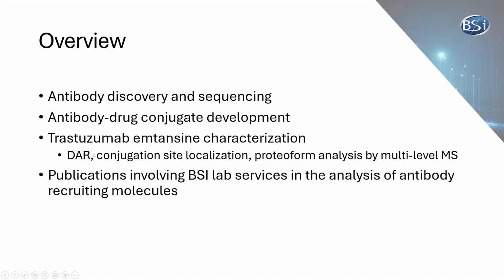And I'll go into how we calculated the drug to antibody ratio, localized conjugation sites, and perform proteoform analysis by multi-level mass spec. And lastly, I'll just highlight a couple publications that came out of a collaboration our lab had with an academic collaborator from McMaster University.